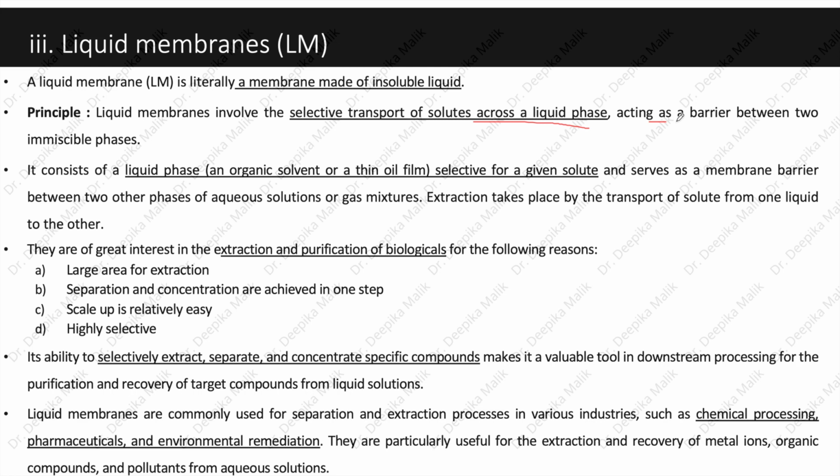It consists of a liquid phase, an organic solvent, or a thin oil film selective for a given solute, and serves as a membrane barrier between two other phases of aqueous solution or gas mixtures. Extraction takes place by the transfer of solute from one liquid to the other.